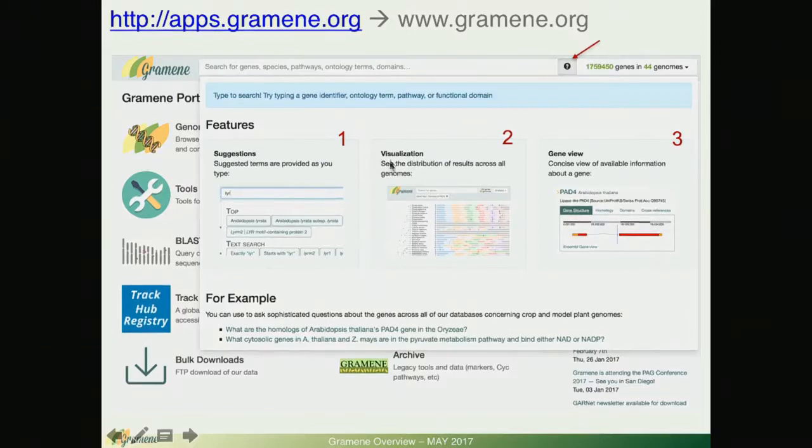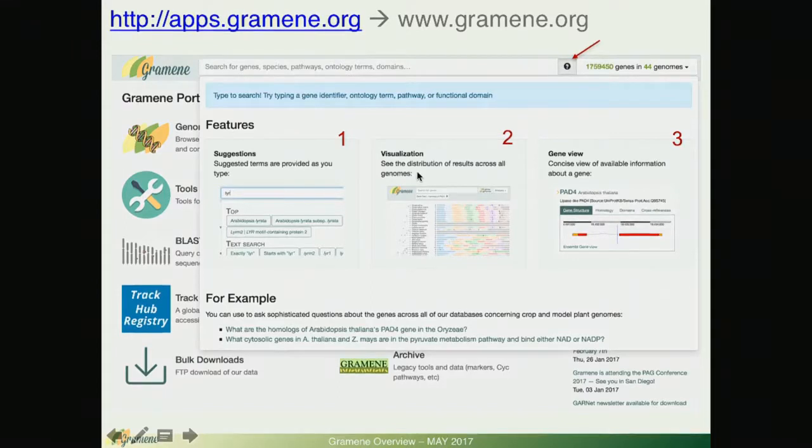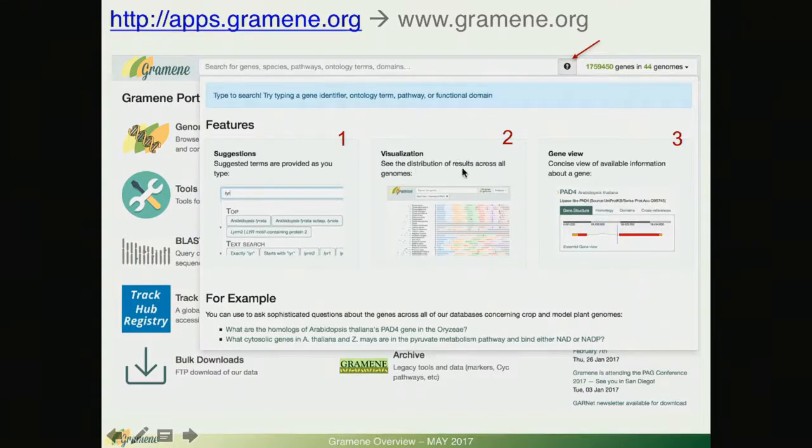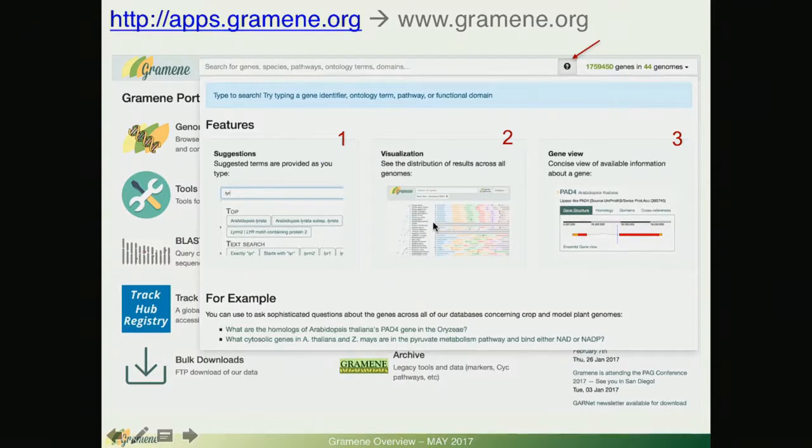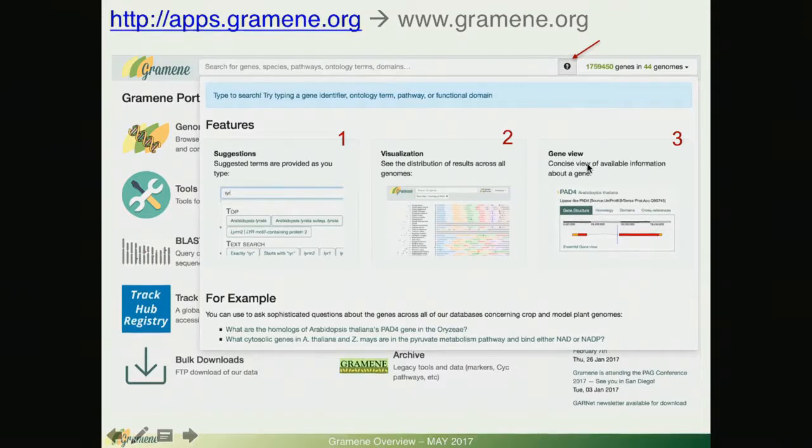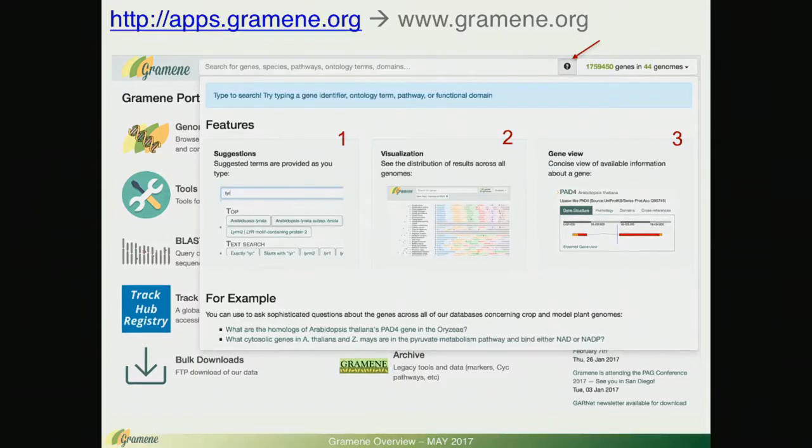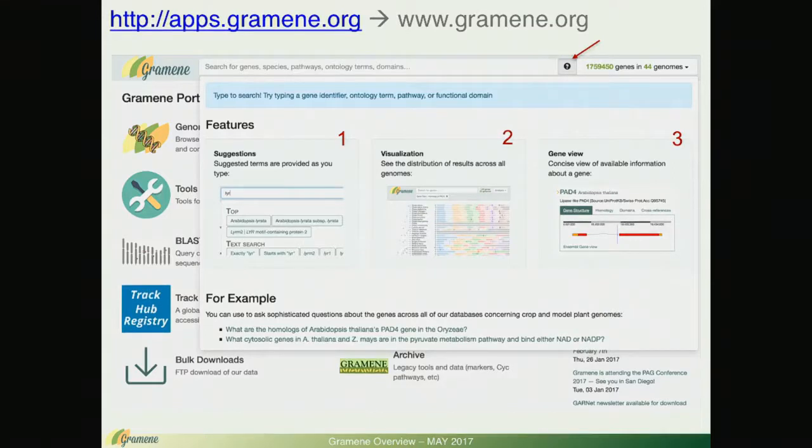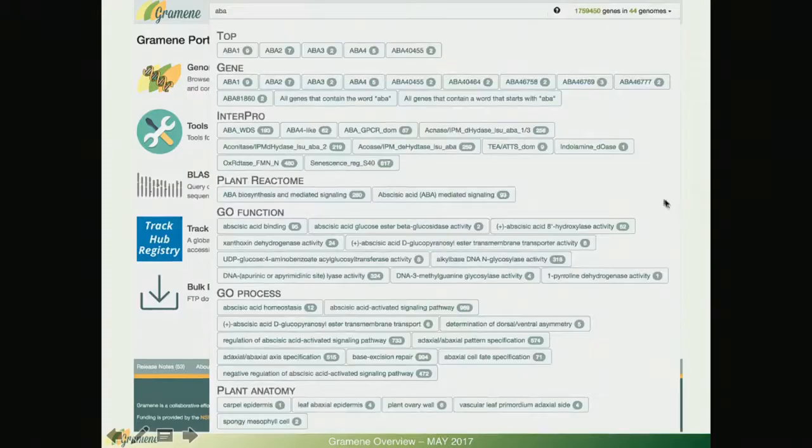Following that, your results will be visualized distributed across all 44 genomes in the Grameen database and finally you're going to be offered with a gene focused view concisely for things like genomic location, expression, homology, pathways and cross references and I will demo these.